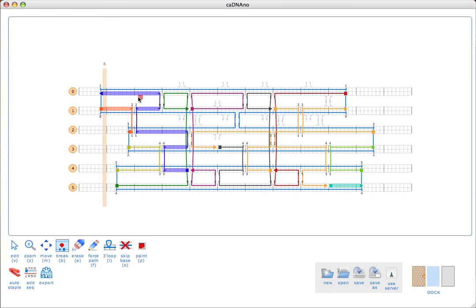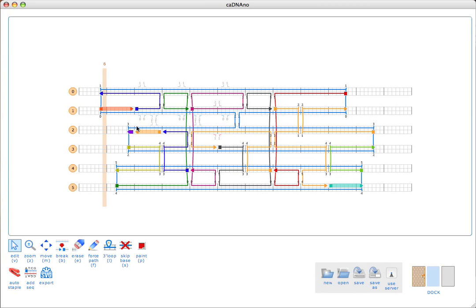I still have this strand which is highlighted because it's too short, and there's really nowhere for us to go. So I might actually just remove these crossovers and then combine those staples with other staples.